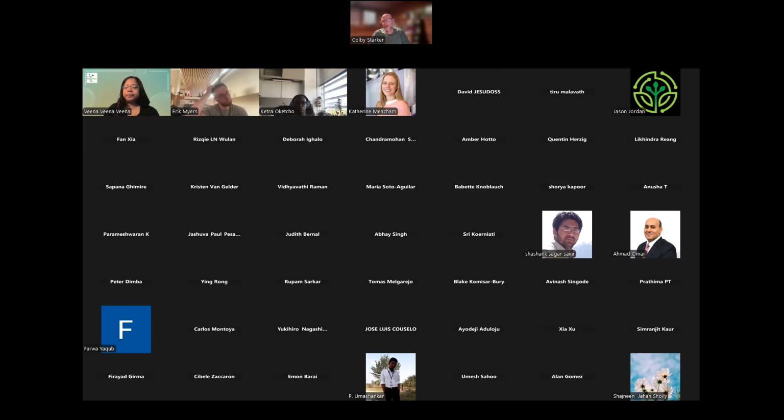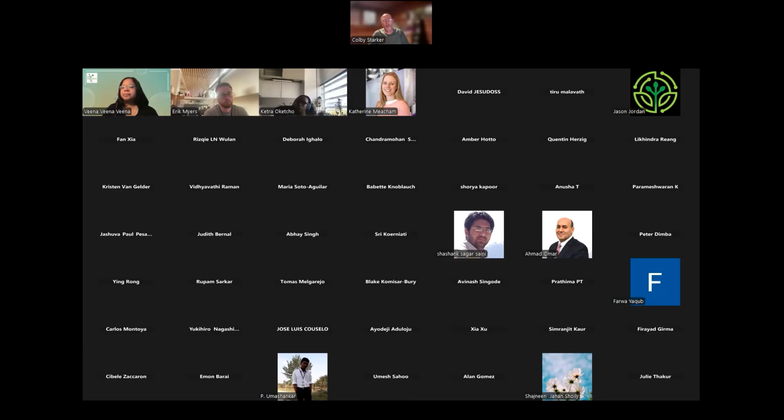Yeah, so that's also a little difficult. We don't have a ton of experience with that because as people who are basically trying to develop new tools, we mostly don't work in crops or plants that don't have relatively good genomic resources. But if I'm doing that, the first thing is obviously you need to have the sequence of your target gene.